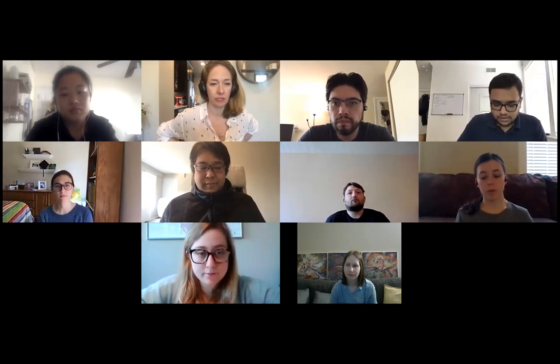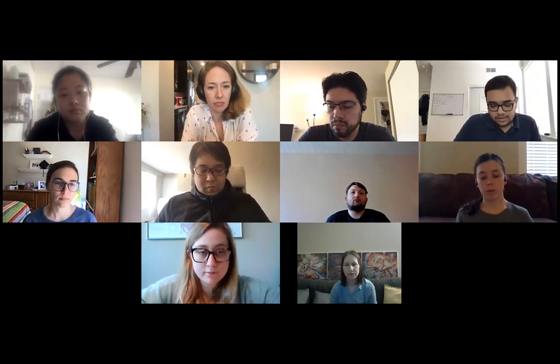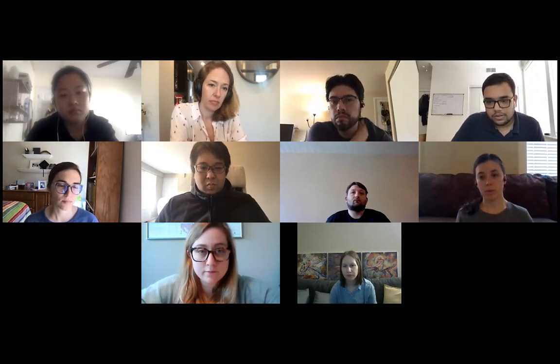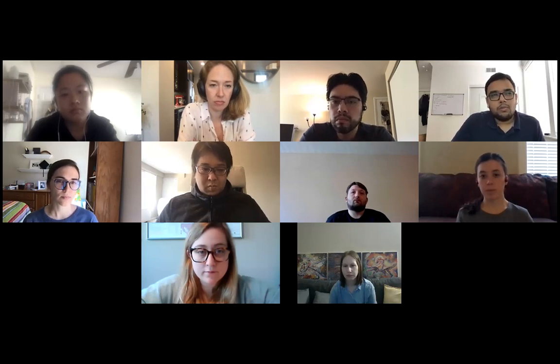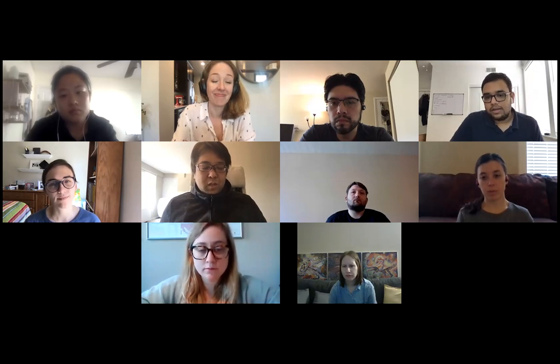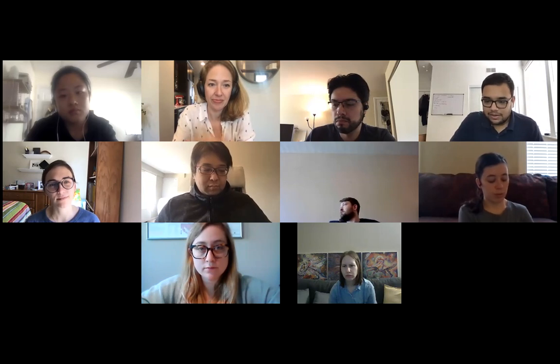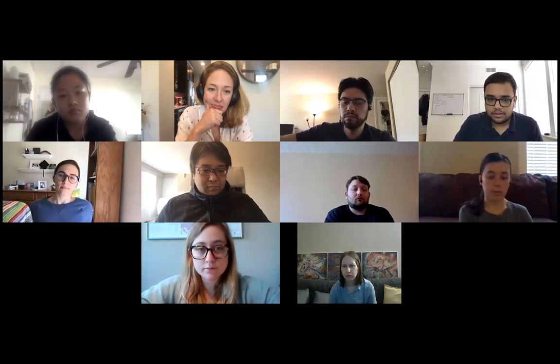So I had a question, Kenji. Let's say I have single cell RNA sequencing data, and I'm not sure about how good its quality is. Maybe there's a lot of dropout or noise, and I run it through the CellOracle pipeline. Do you think it's possible to have one quantitative metric to see how confident I can be in the network that is inferred? Once I create a network using CellOracle, is there a metric which I can look at to see whether it ran well on my data set or not?